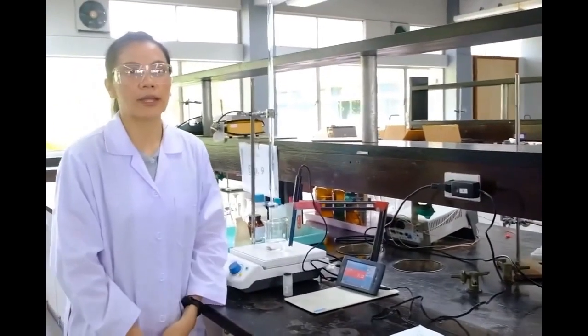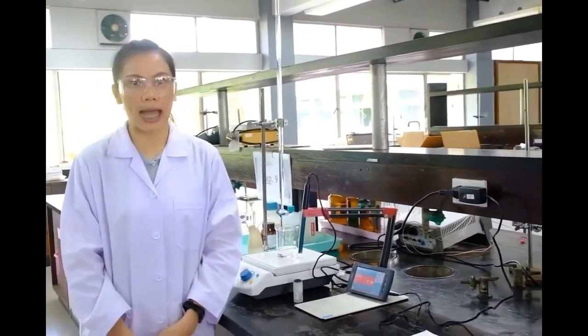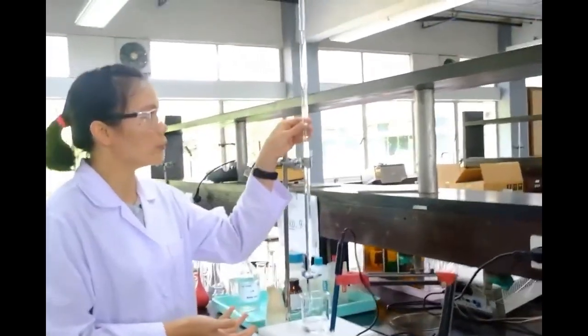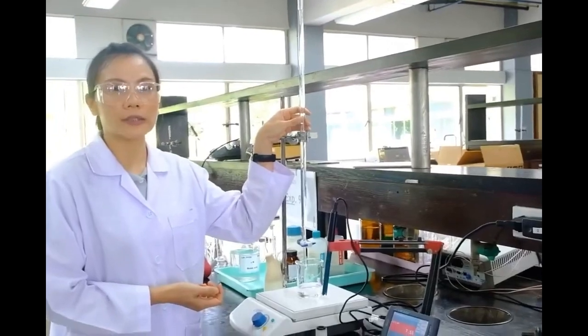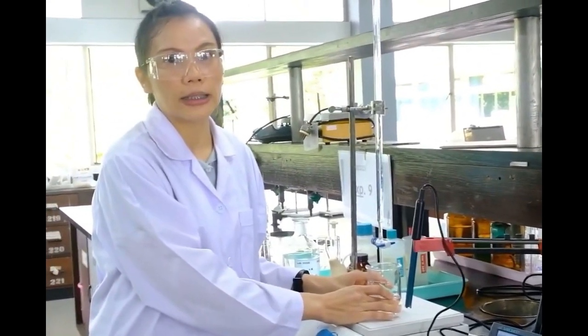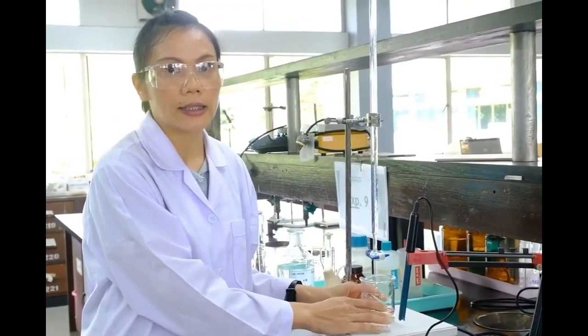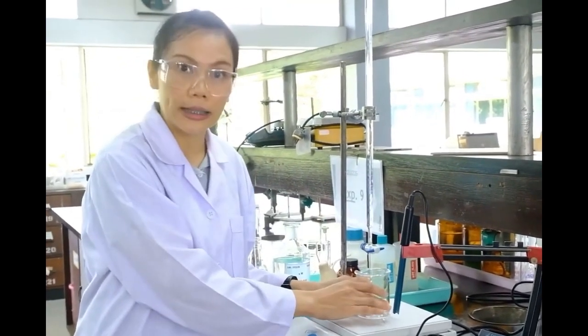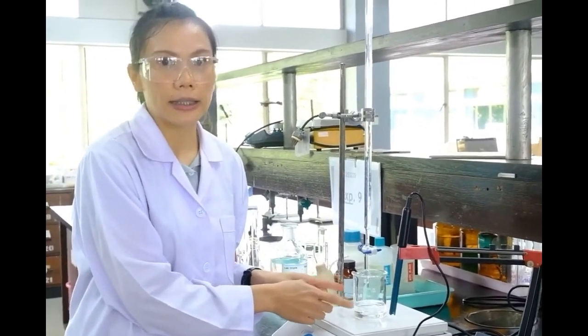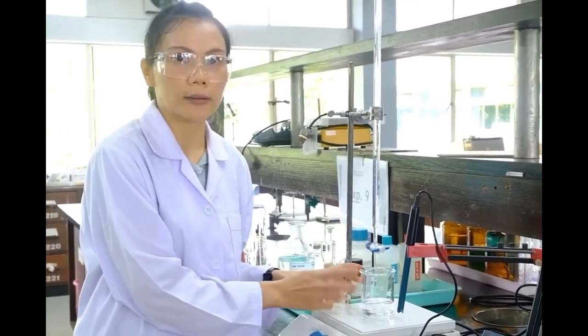After students have roughly titrated to find the endpoints, the next step is to set up the equipment like this. A burette containing sodium hydroxide solution. A beaker containing 20 milliliters of maleic acid solution, prepared using a pipette. 50 milliliters of distilled water, prepared using a measuring cylinder.